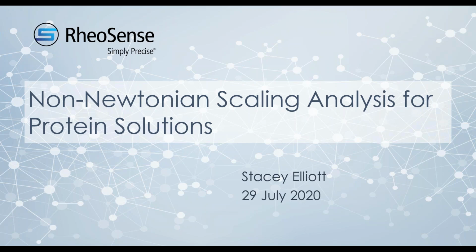So viscosity versus shear rate data has very practical benefits. Obviously, if you know what shear rate is relevant for your application or your processing conditions, then you would want to measure in that range. But as you'll see, I hope, as we go through the webinar, it can also be used as an investigative tool. It can really help you understand what's going on in your formulation based on the components that are there.